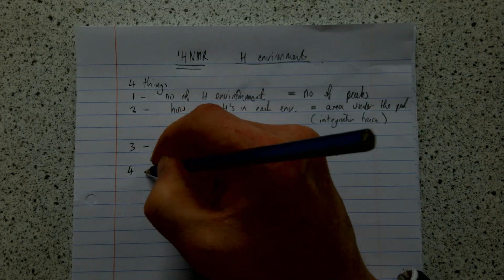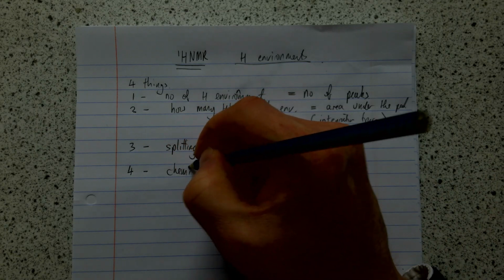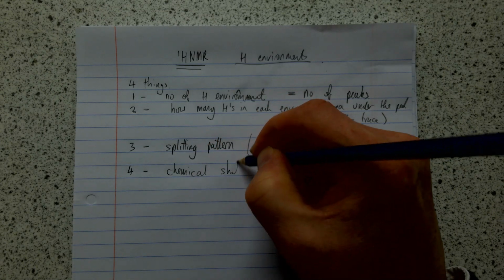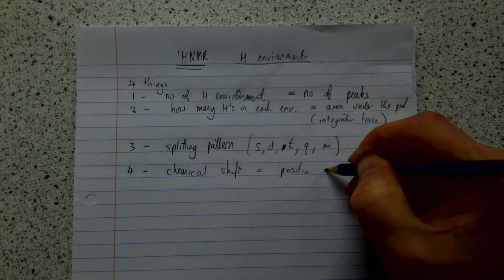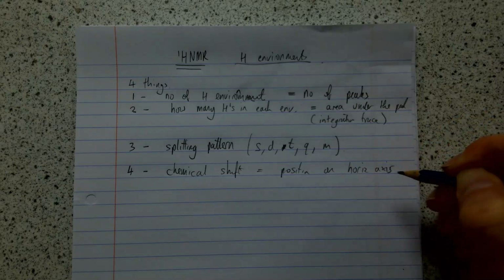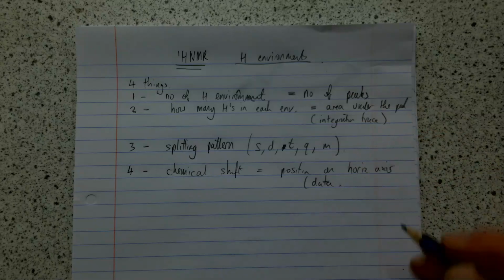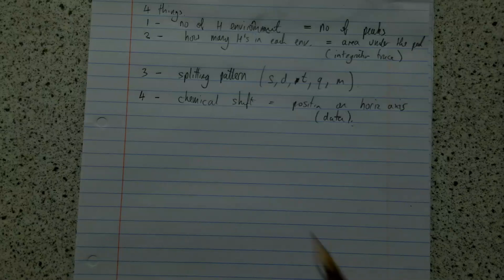And the 4th thing is what we call the chemical shift. I'll probably do these in a slightly different order when I go through them. Chemical shift is equal to position on the horizontal axis, and that is values you get in the data book. So part of the work that you're going to do, and the exercise you're going to do, will be getting familiar with the information in the data book as well.